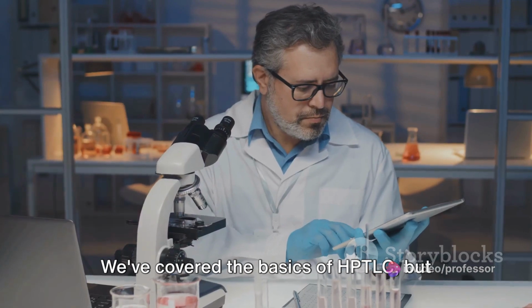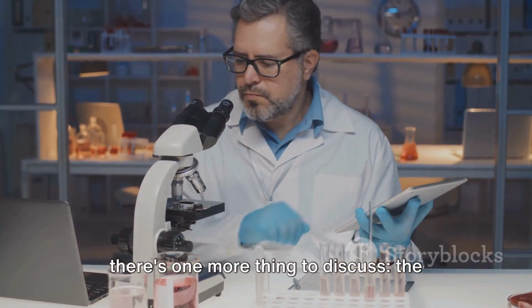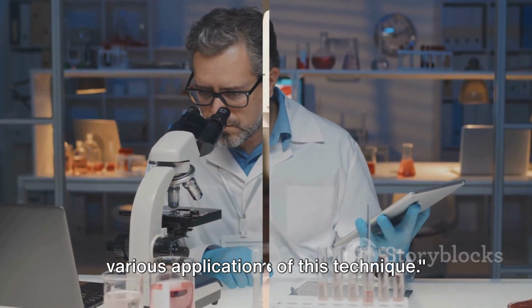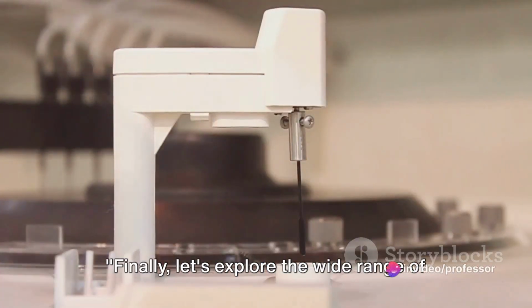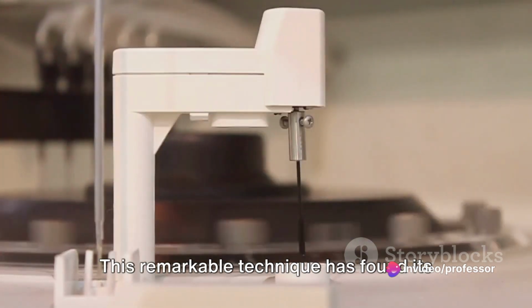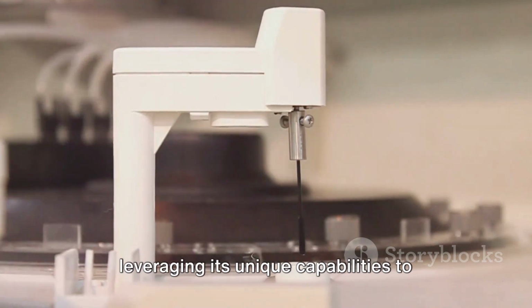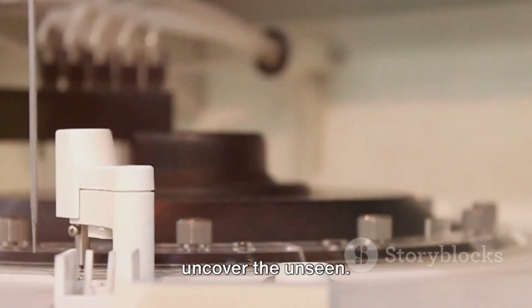We've covered the basics of HPTLC, but there's one more thing to discuss: the various applications of this technique. Finally, let's explore the wide range of applications of HPTLC. This remarkable technique has found its way into several diverse fields, each leveraging its unique capabilities to uncover the unseen.